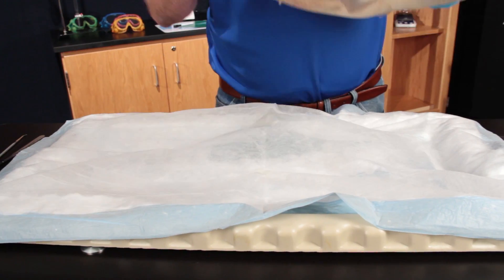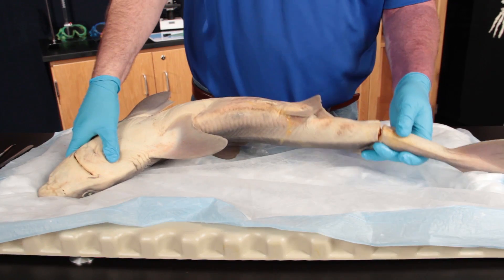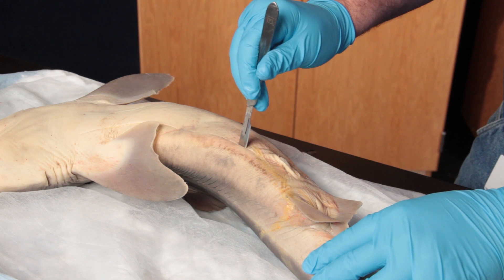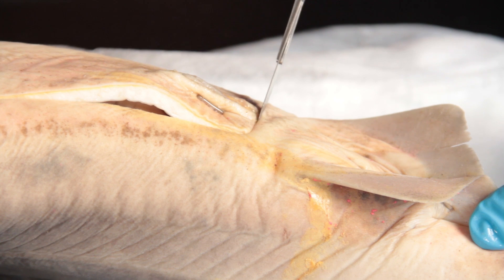Position the dogfish shark ventral side up and make the incision from the left pectoral fin to the back wall of the pelvic girdle. Next, make a transverse incision across the pelvic girdle.